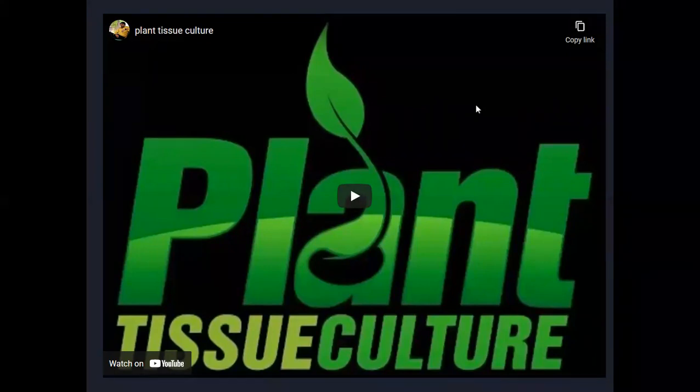He invented different types of methods and procedures for plant tissue culture, so he was called the father of tissue culture. After that scientist's experiments, many scientists did their experiments on plant tissue culture techniques. So what are the plant tissue culture procedures we follow? Here it is.